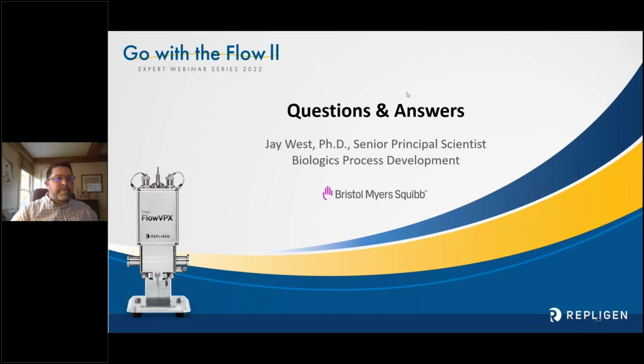Okay, next question. How did you align with other functions such as QC, AD, and MSAT to adopt inline VPX?